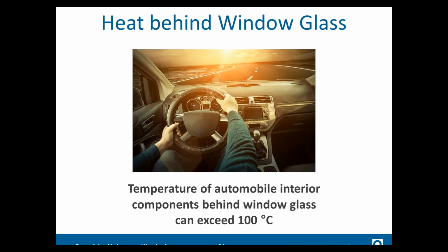And then the final thing that we want to talk about in regards to heat, particularly for automotive interiors, but this also applies to any kind of testing for roofing or anything that's going to be in an attic space, is that the temperatures in these areas can often get very high. Anywhere where the heat can be trapped can get very high. In automotive tests, it's not unusual for some of the temperatures to exceed 100 degrees Celsius, and so again, know the application, and then you can design an accelerated test around that.